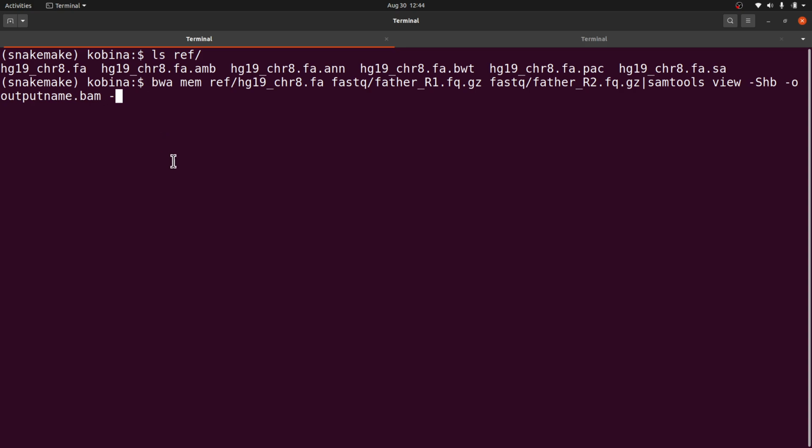Snakemake allows you to write reproducible and scalable pipelines. So in some situations, if you're writing a pipeline, you can use Snakemake so that it helps you to manipulate a couple of things and automate some stuff. That's why I'm showing you how to do that, but you can still run everything on the terminal like this on multiple samples.